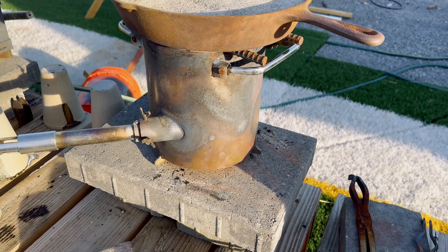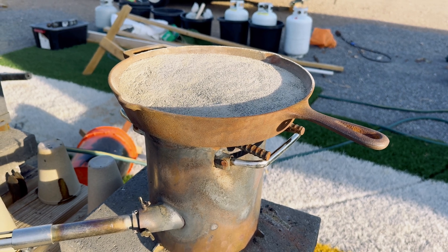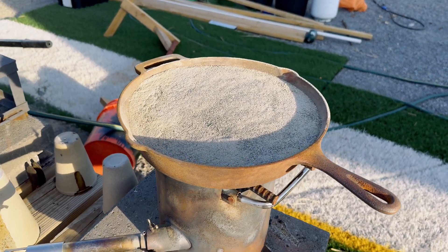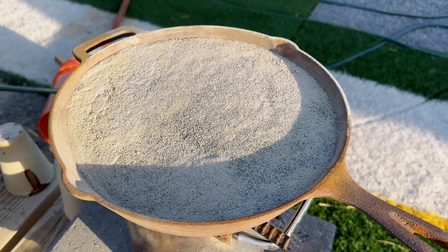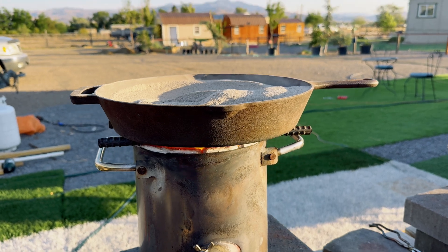Now we are going to roast our ore, and the reason why we need to roast our ore is because when I was cooking the ore I could smell the sulfur burning. That means there are sulfides in the ore and we need to roast the ore to crack open the sulfides, which will release the gold if there is any gold in the sulfides. I get the temperature up to 900 degrees to roast our ore.